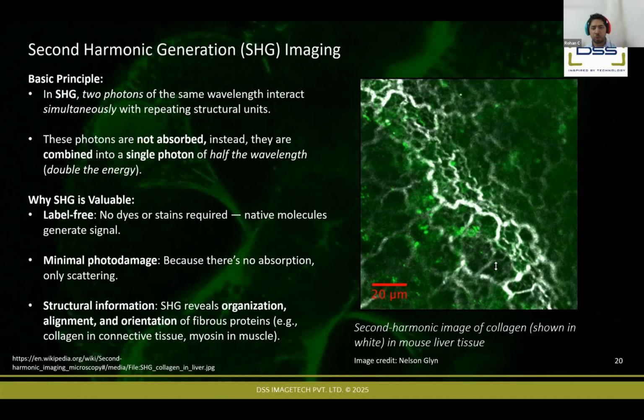You can try to locate your specific cells of interest and see what other cells are coming in contact with these cells. If you use 2 to 3 fluorophores to label your specific cells and a marker to label the tissue, you can essentially do 3D reconstruction and do this kind of specific identification of cells within different layers of the tissue. Yes, it is possible.